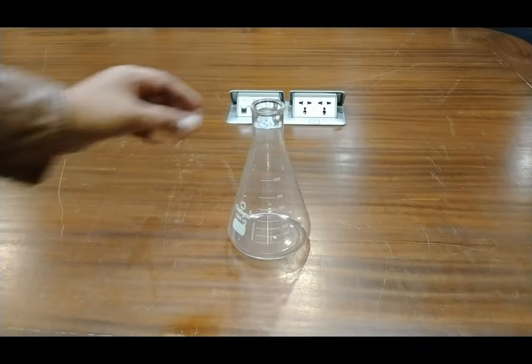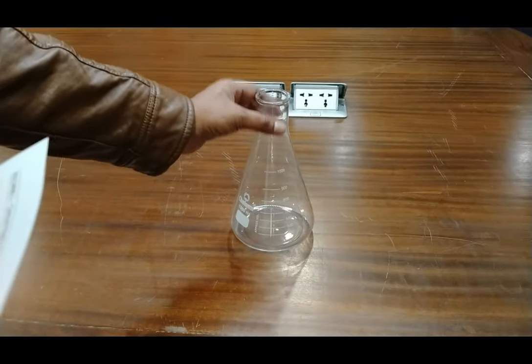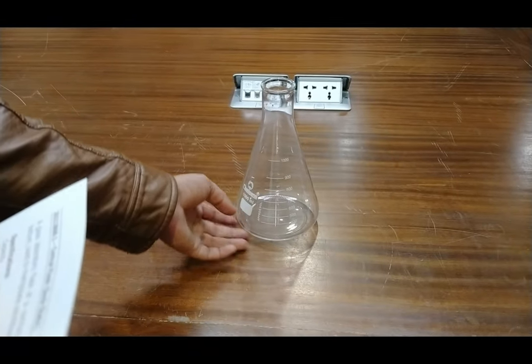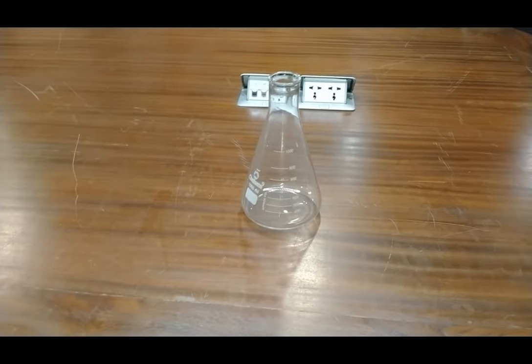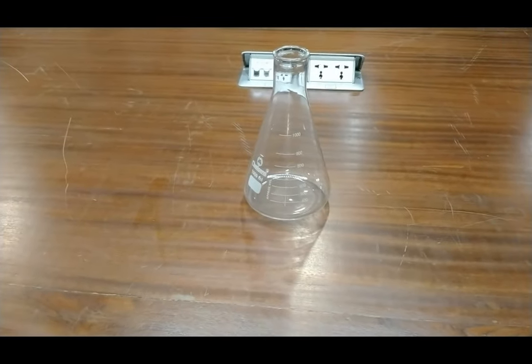It has a narrow tubular neck and a flat bottom. It is used to manipulate solutions or to carry out titrations in chemistry or pharmaceutical labs.